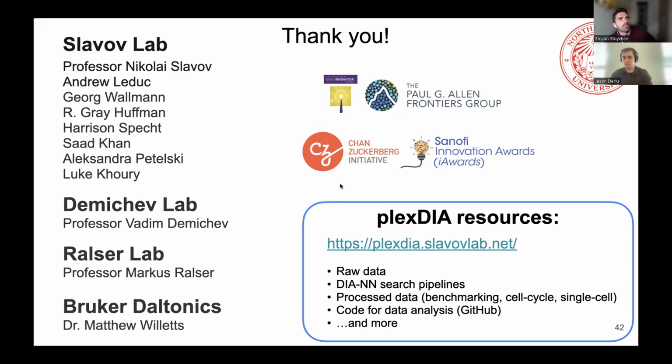Did you see any shifts when you did the data acquisition with the timsTOF Pro, because of the labeling potentially? Yeah, for the timsTOF acquisition, we only used 5 different MS2 windows, which came out to be 3 diaPASEF scans. And we didn't really go to super high m/z ranges. We just kept it where the precursors were concentrated. So I think we went from 300 m/z to 800 m/z.